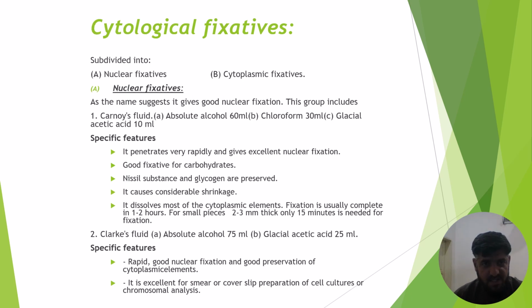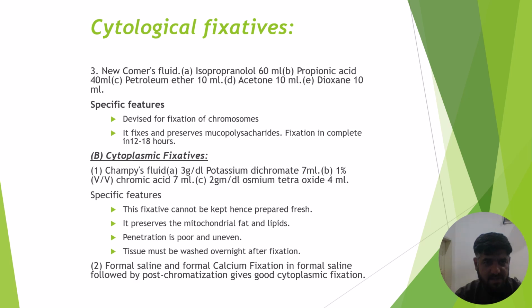Next are the cytological fixatives, which are further divided into nuclear fixatives and cytoplasmic fixatives. Nuclear fixatives, as the name suggests, give good nuclear fixation. This group includes Carnoy's fluid, Clarke's fluid, and Newcomer's fluid, while the cytoplasmic fixatives include Champy's fluid and formal saline.